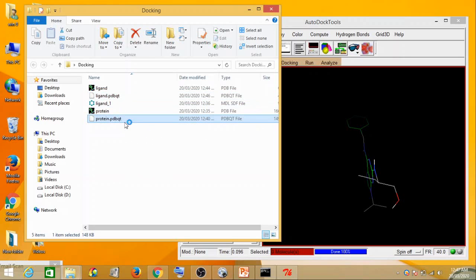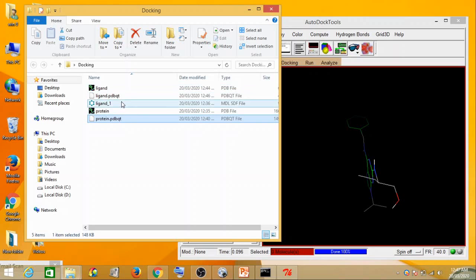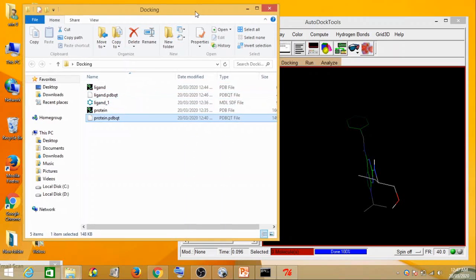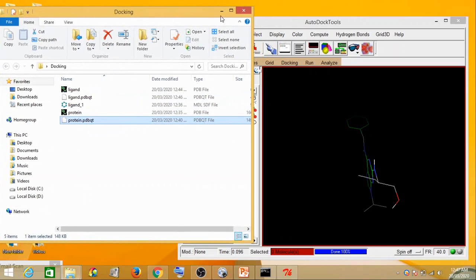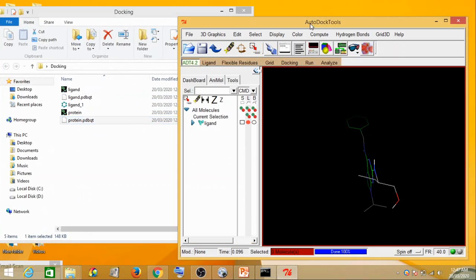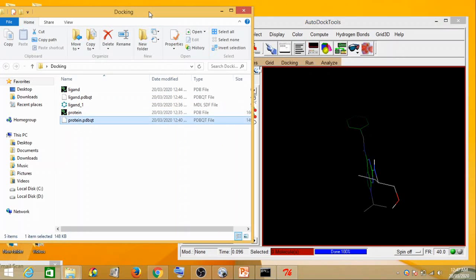We now have the ligand.pdbqt file and the protein.pdbqt file. That means we have completed the second step of molecular docking, which is your protein and ligand preparation. Now let's move to the third step, which is preparing a grid for the protein.